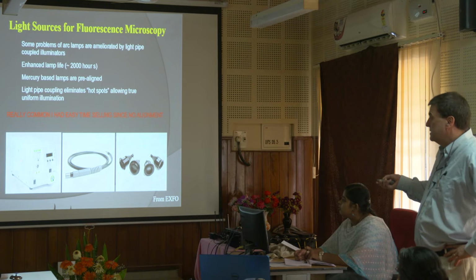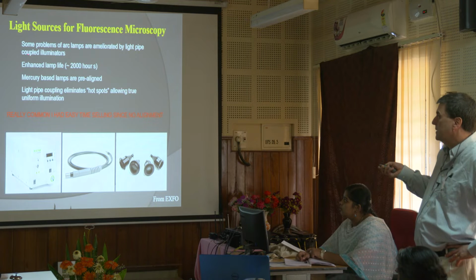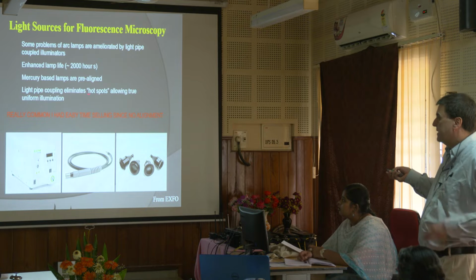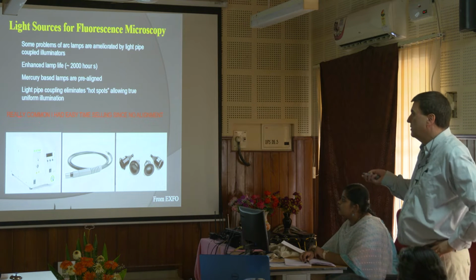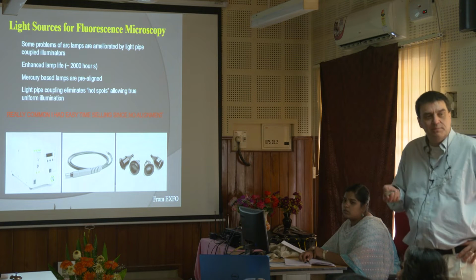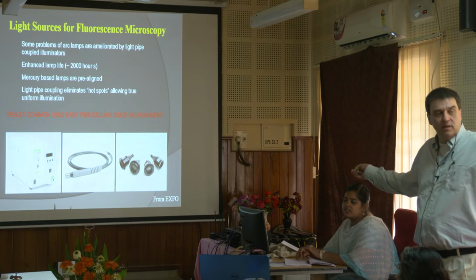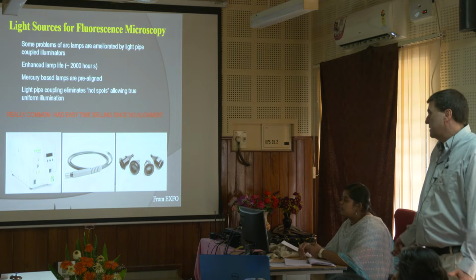So when I was in sales, this was awesome, because these came out. You don't have to align them. They last 2,000 hours. The bulbs cost a little more, but still. It's pre-aligned, and you don't get that bright spot in the middle that you have to align with the other one to get rid of. So they were really common. This paid my kids' way through college probably, selling these things, because it was so easy. You don't have to align them. They last longer. They're brighter. I mean, they're just better. So they sold really easy.